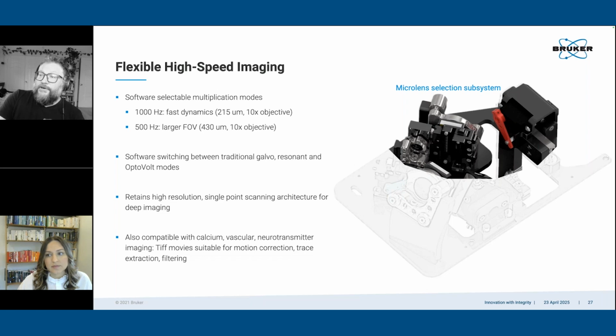I was going to say I don't really know if there's a lot of data out there because there aren't a ton of labs doing it, but there is the Pasca lab at Stanford who images organoids on their system, and there's also a group at, where are they? Santa Barbara, that has one, and they're also doing optogenetics in their organoids. Cool. Maybe I should actually see what their data looks like. I haven't actually. They've only had their microscope for about a year now, so pretty early on. But yeah, it's definitely compatible with organoids. If you put in the effort to have the appropriate chamber under your scope, you can do it.